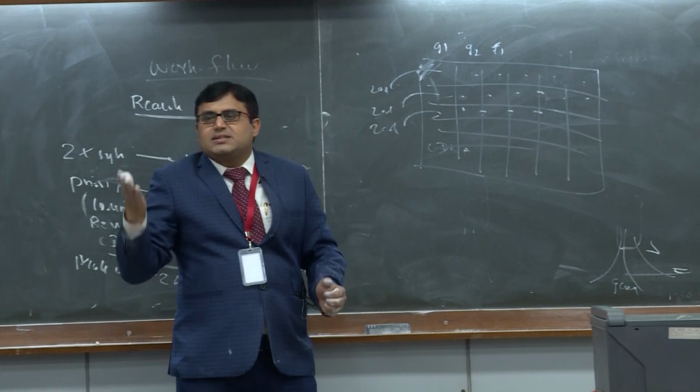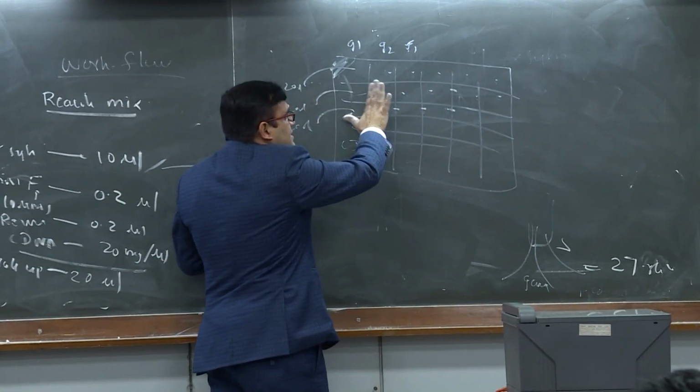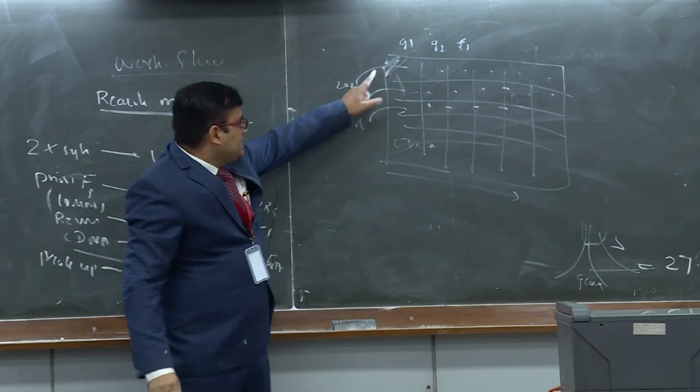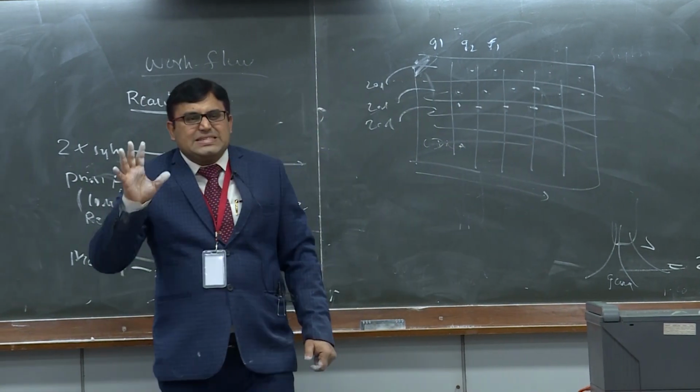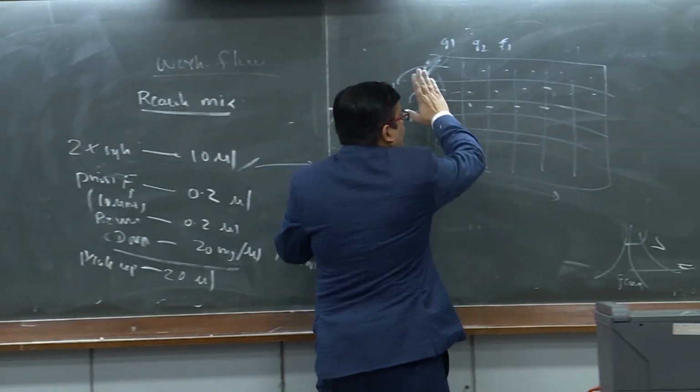then you have to take that parafilm sheet and put it from one side, from left to right. Just stick one side and then slowly keep on pasting over this. Once you paste the parafilm, then I have written roller. Take a roller and then roll it.